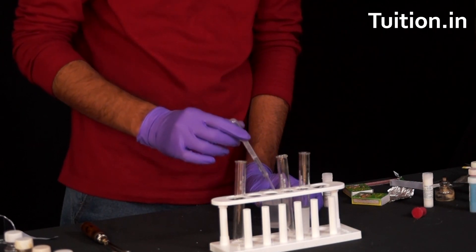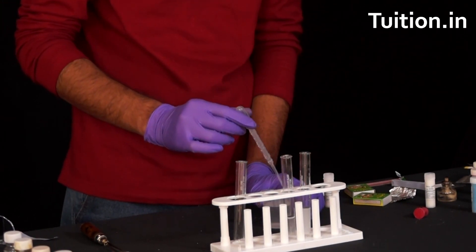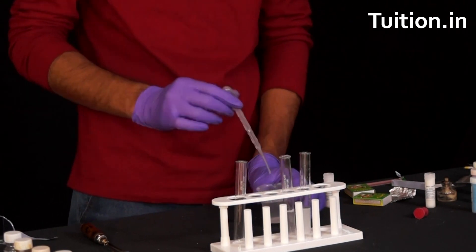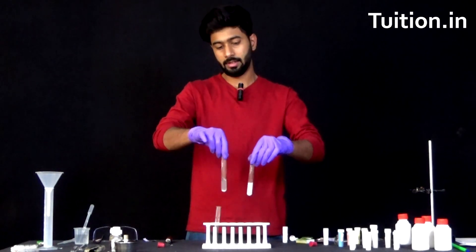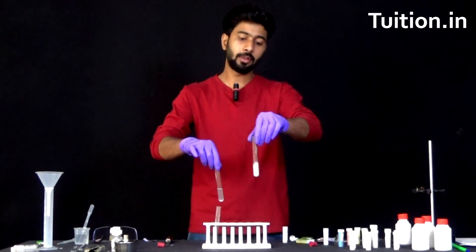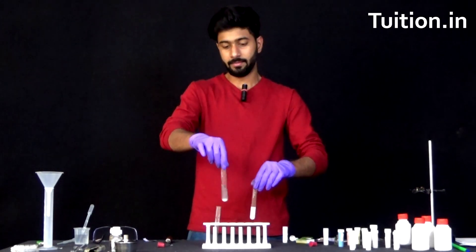Let's add another 5 ml here as well. So water has been added to both the test tubes, and now it's time for us to shake them. This is our barium chloride solution and this is our sodium sulphate solution.